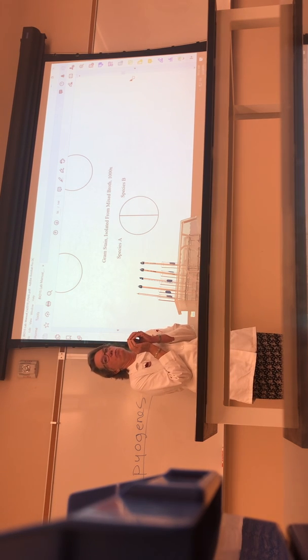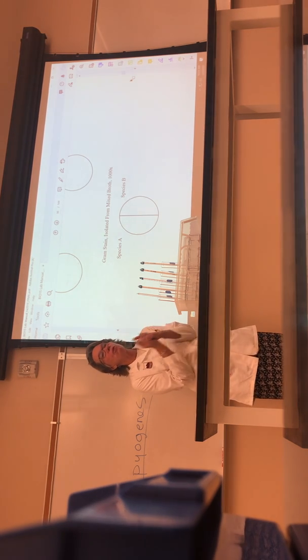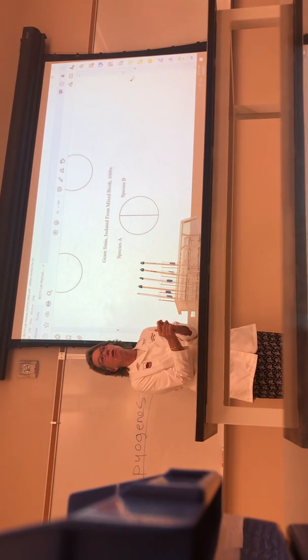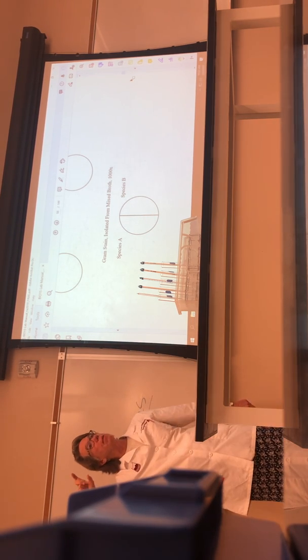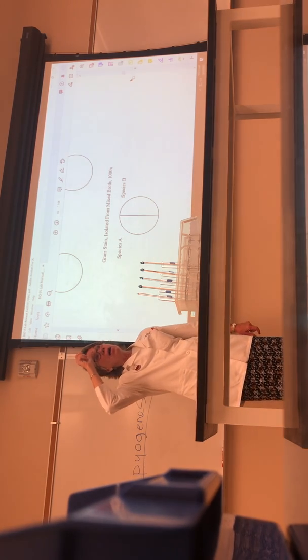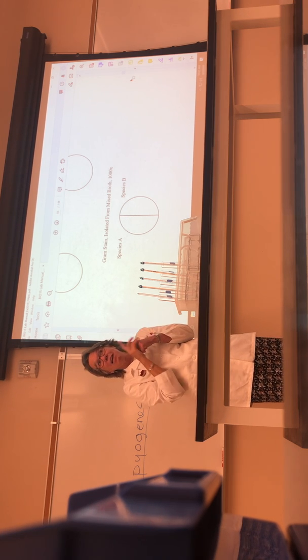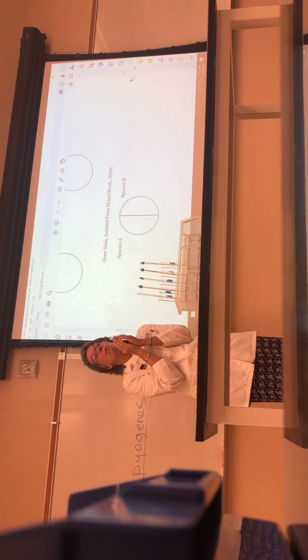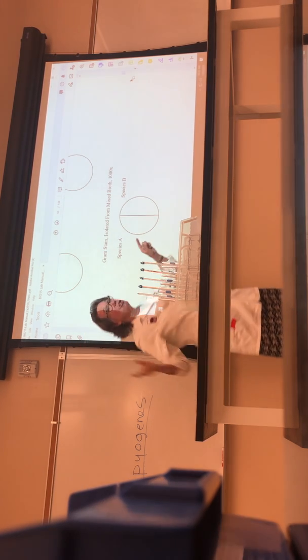You're also, guys, going to try to find the one you're missing. Most of you are missing your gram positive, correct? That means your gram negative is already growing on a slant. You're just going to confirm that today. Most of you should have a gram positive somewhere out there on your plates. You may have gram stained it last time, but we're going to try to get it growing on a plate all by itself.